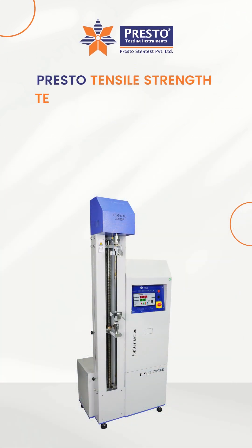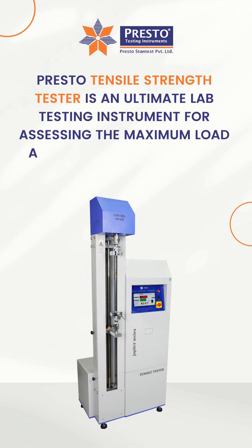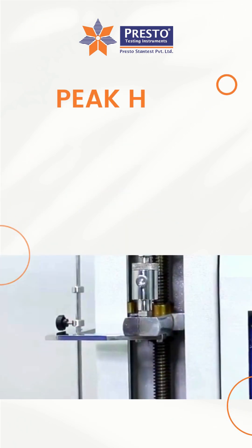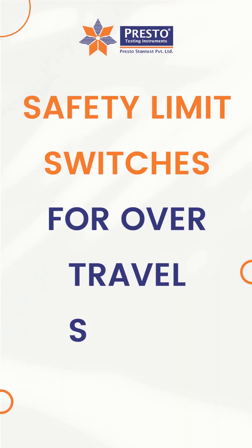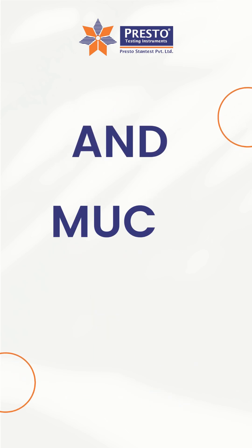Presto Tensile Strength Tester is an ultimate lab testing instrument for assessing the maximum load a material can withstand without getting deformed. It is designed with advanced features including a bright LED display, peak hold facility, high-accurate microcontroller-based system controls, non-contact safety limit switches for over-travel safety, a sensitive load sensor with linearity feature, and much more.